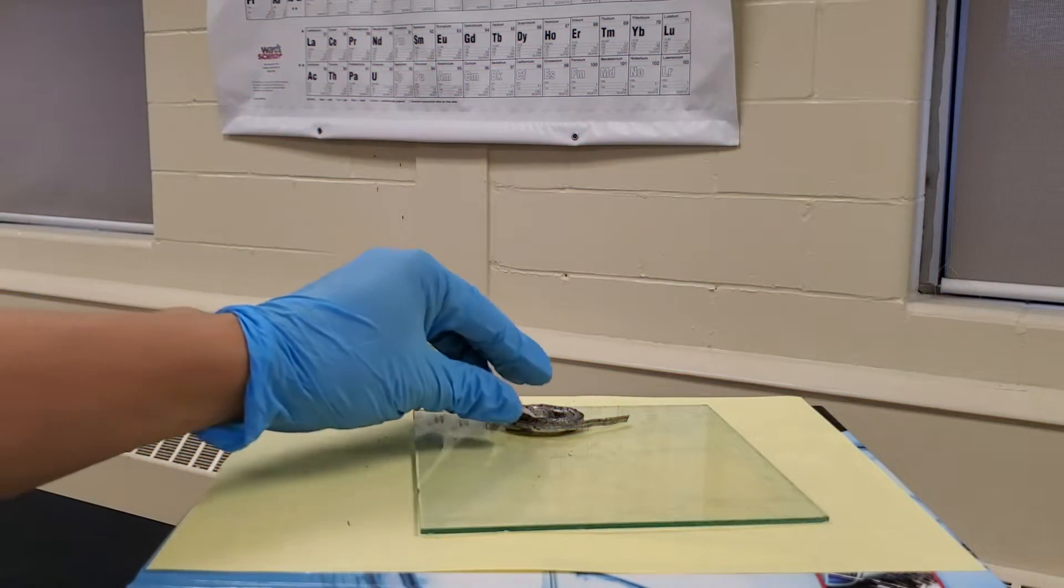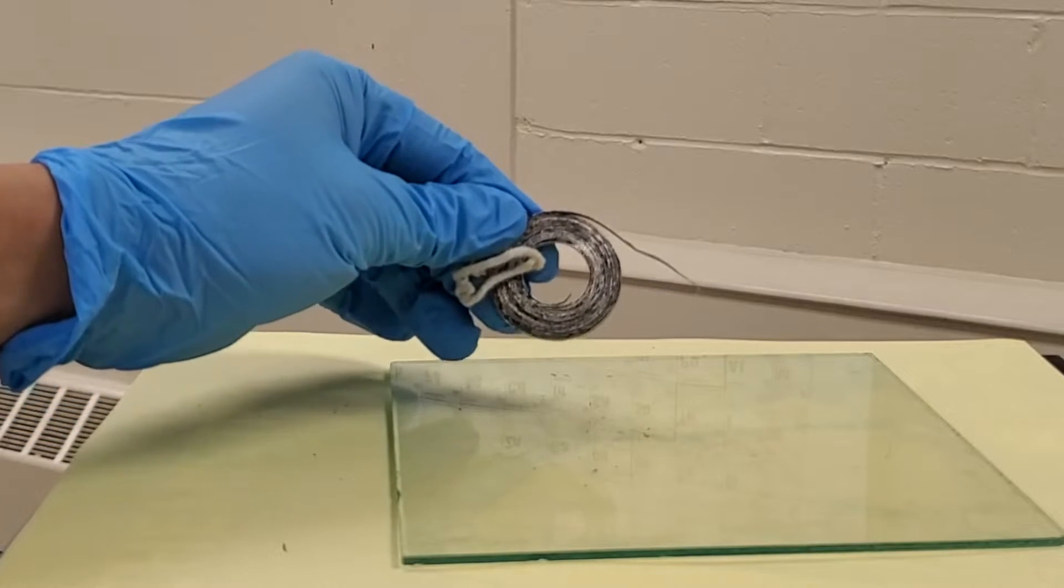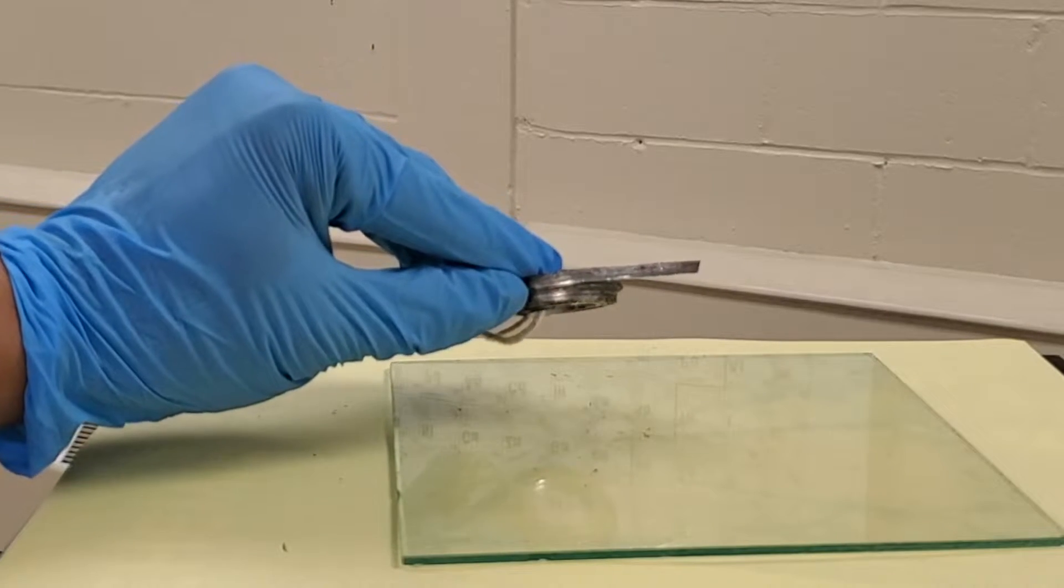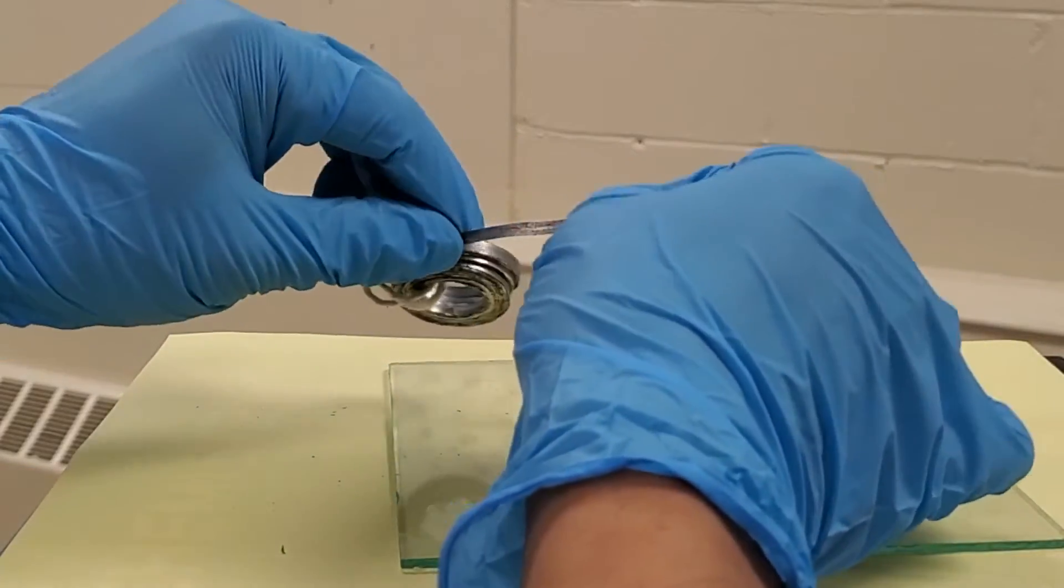This is what magnesium looks like. It comes in a coiled ribbon. It has all the characteristic physical properties of a metal. It's shiny, malleable, flexible, and hard.